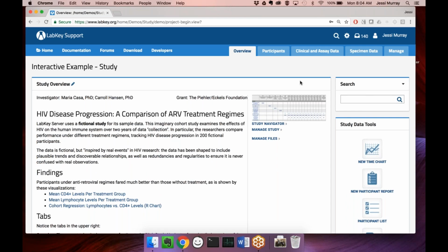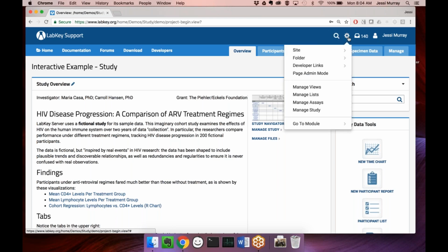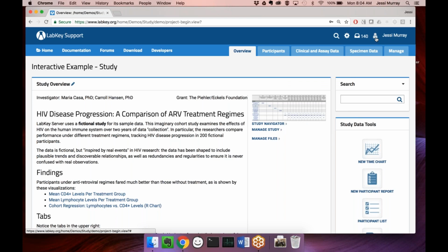A few things that you may notice. We've redesigned the header up here. Instead of having 3 layers, we've shortened it up and made it into 2, and we've updated these menus to be icon-based. There's still the admin menu, if applicable.